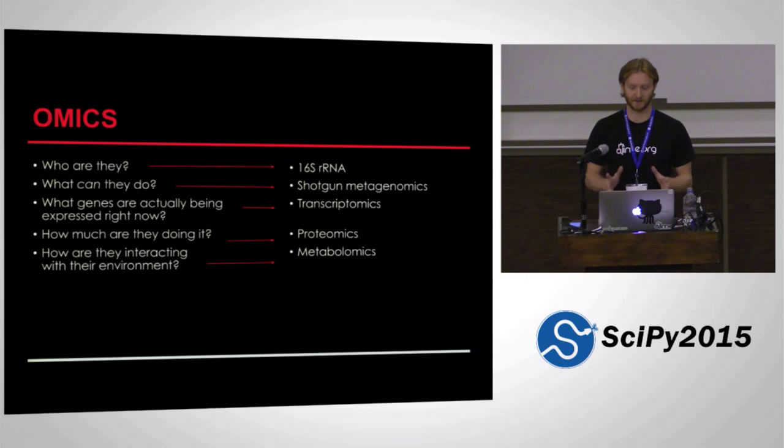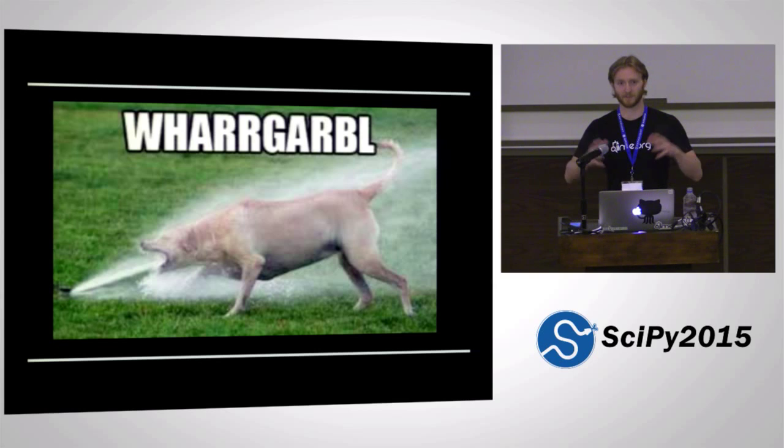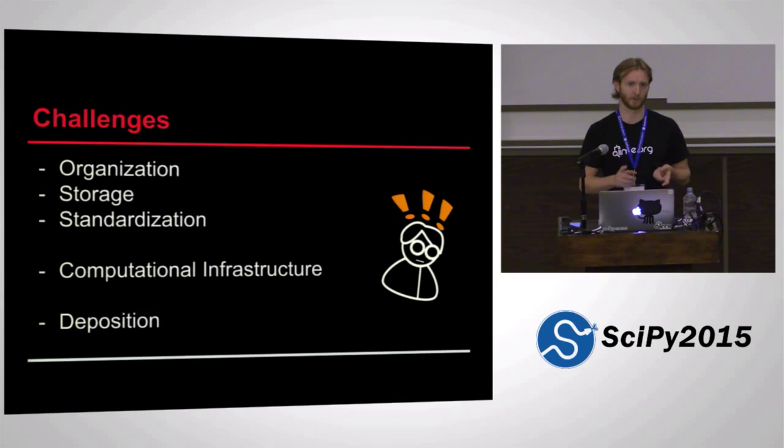Now, this is going to be a ton of data, and it can be a little bit like drinking from a fire hose, because even just one of these techniques, metagenomics, can result in terabytes of data. Now, if you wanted to analyze samples using more than one omics technique, you have to combine that data, and when you consider all the other metadata, integrating it can provide a lot of technical challenges related to the organization of the data, the storage of the data, the standardization of the metadata that'll allow it to be easily reused.